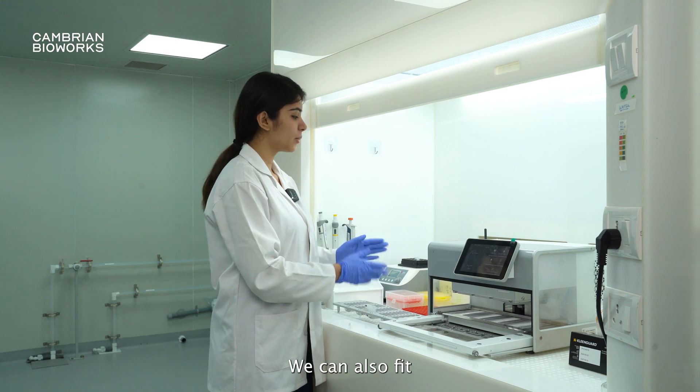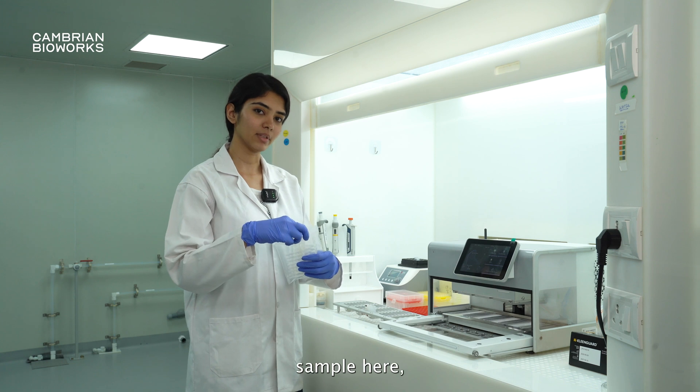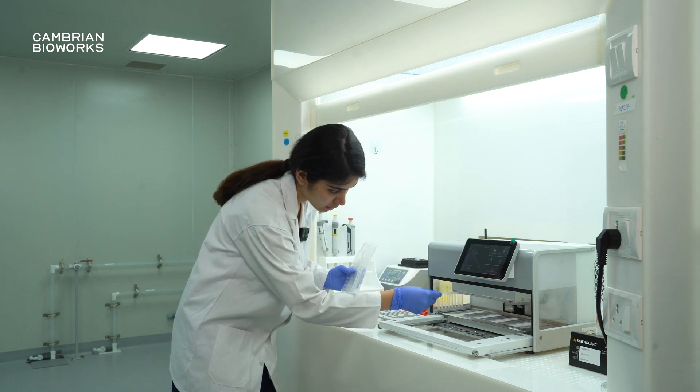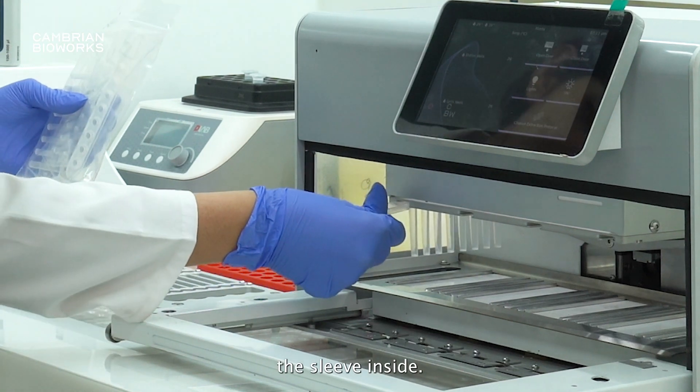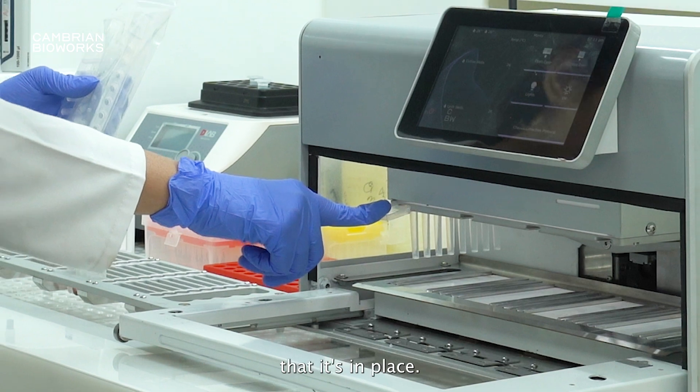While that is ready, we can also fit in the magnetic sleeves inside the Manta. Since we're running only one sample here, we will fit one magnetic sleeve. While you push the sleeve inside, you have to ensure you hear the click sound to make sure that it's in place.